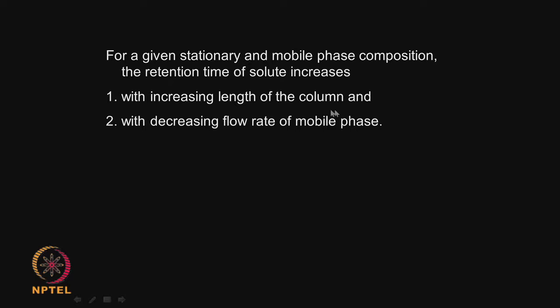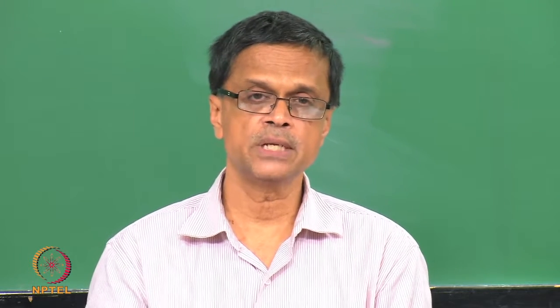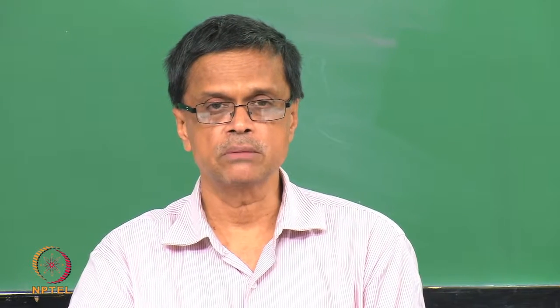So, if I increase the length, it will take much longer time, and if I decrease the flow rate, it will also take much longer time. Please note, I am not talking about the separation efficiency, but only about the retention time. If I have two components, then both the components will feel the same. If I reduce the flow rate, both the components will come slower. If I increase the length, both the components will come out slower.